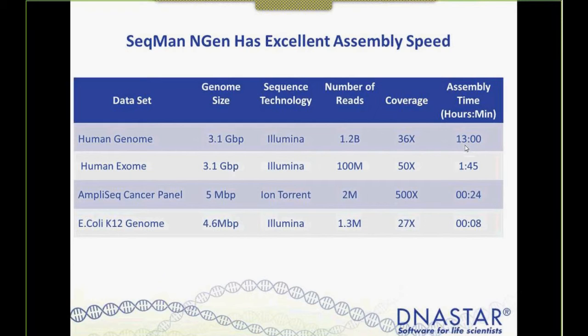processing. A lot of the open source programs will take more than 13 hours just to do the assembly, and then you have to go and build one chromosome at a time, go through and build all the variant files, and then figure out how to do the analysis. So it can be a big, big time saver having a piece of software that can just go from A to Z in a short amount of time.